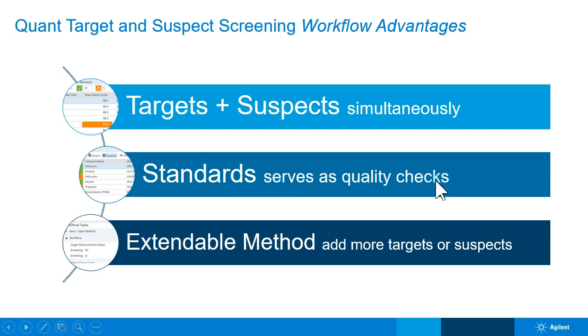You've got that backing when you show your suspect results, in the same process. And I will go through and show you some new tools that make it much simpler to either add more targets or potentially find suspects by the standards and then add them into your target list, and to manage those ions and collision energies as you go through that process.